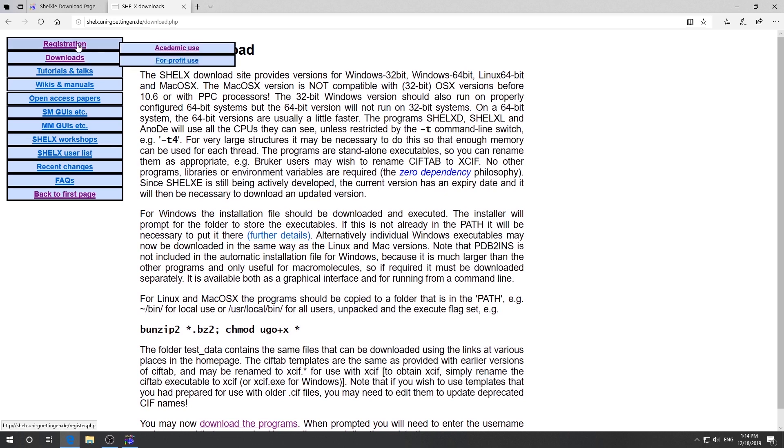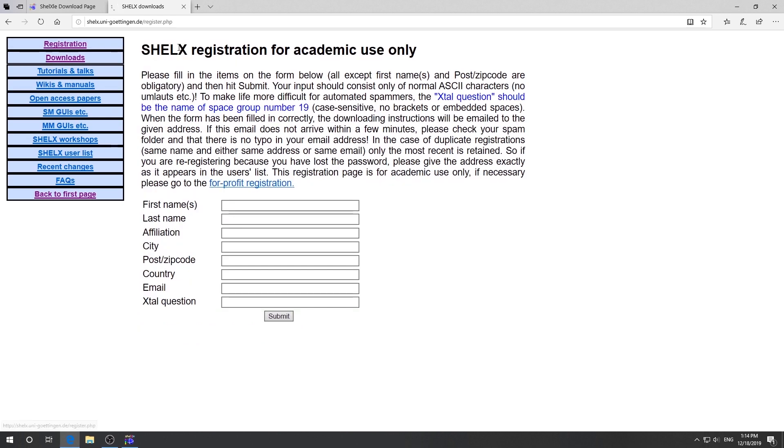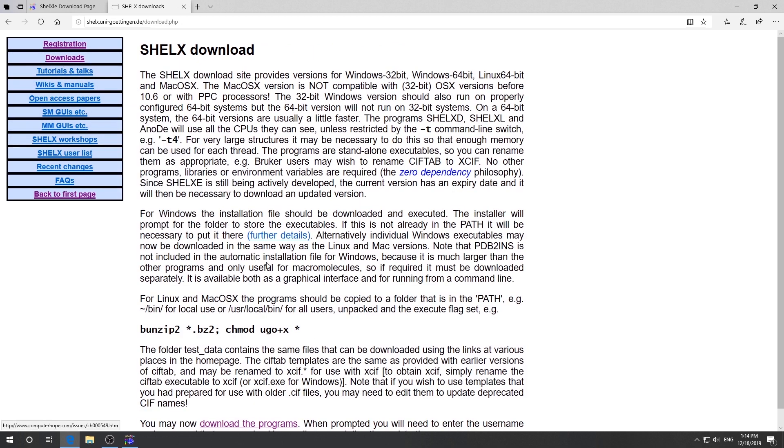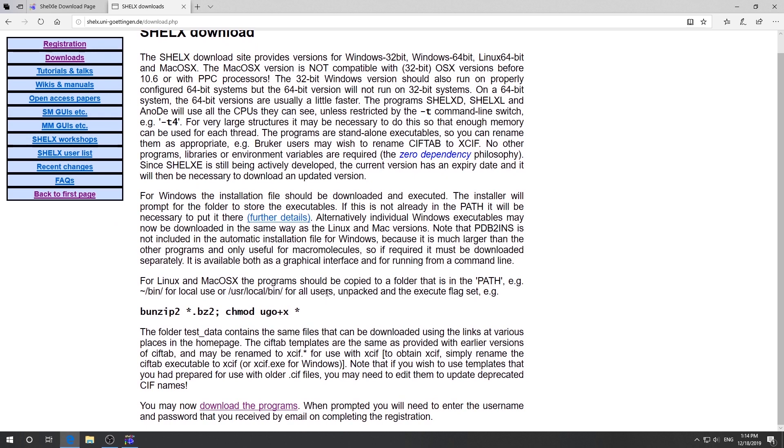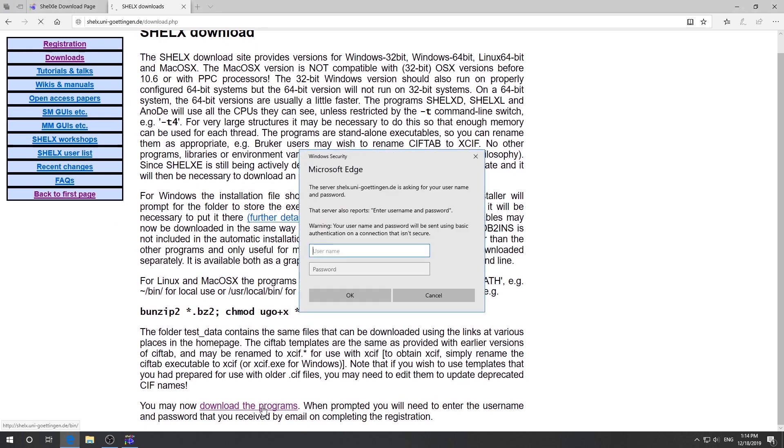Click register, academic user, and you put in all the information and click submit. So after the registration, you click download. Scroll down to the bottom, click download the programs. Now you type in the username and password you just created. Then click OK.